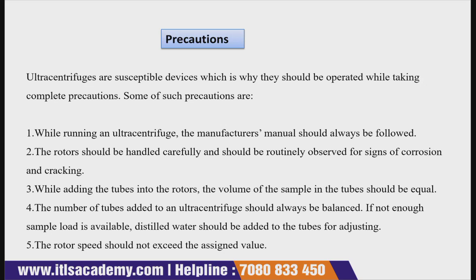The rotor should be handled carefully and should be routinely observed for signs of corrosion and cracking. While adding the tubes into the rotor, the volume of the sample in the tubes should be equal. This is a very important point. Again, the number of tubes added to the ultracentrifuge should always be balanced. If not enough sample is available, distilled water should be added to the tubes for adjusting the volume.